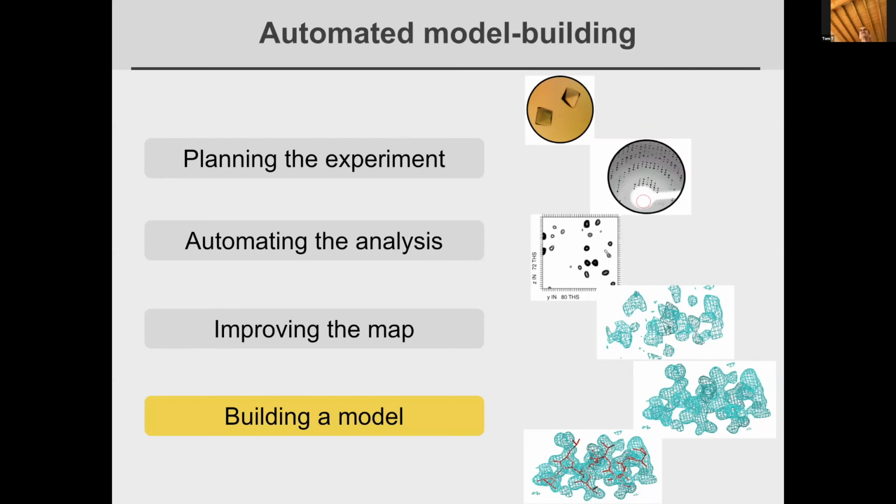The third level is you would have to supply a new library of side chains to the program, and you don't have an easy way to do that. It can be done, but we don't have a tool for you to just supply such a thing. But all the tools are there in Phenix to take any library of anything pretty much and build such a thing. Oh, hi, Paul. Great. I'm glad you're back. So you could, in principle, do that, but there's no easy way to do that right now.